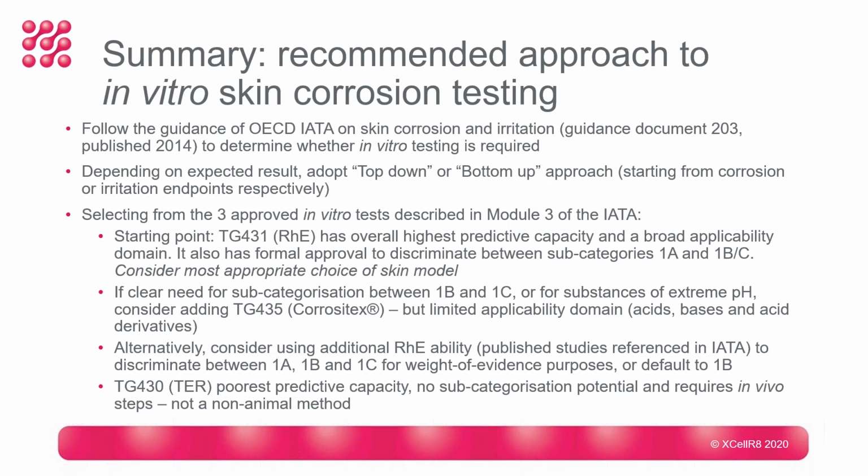And when selecting from the 3 approved in vitro tests, which are described in the IATA and we've looked at today, I would say that a good starting point is the RHE method, because it's been shown to have overall the highest predictive capacity and a broad applicability domain. And also it does have formal approval if the EpiSkin method is used to discriminate between subcategories 1A and 1B/C.